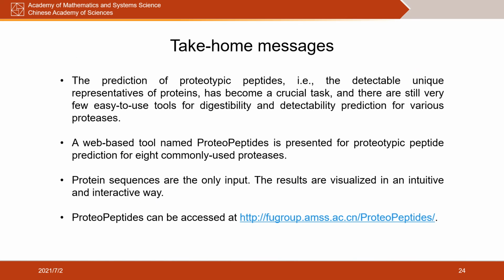At last, let me sum up some take-home messages for you. We present a web-based tool named ProteoPeptides for proteotypic peptide prediction for 8 commonly used proteases, and ProteoPeptides can be freely accessed at this link. Welcome to use our tool.